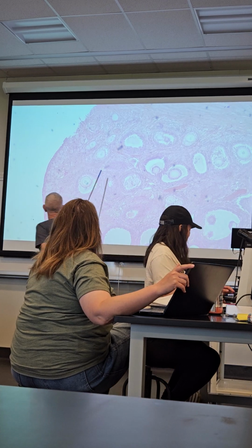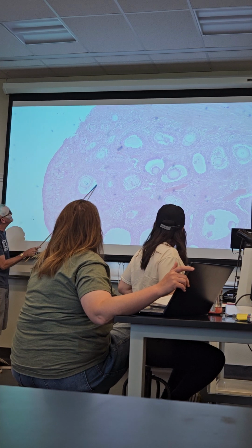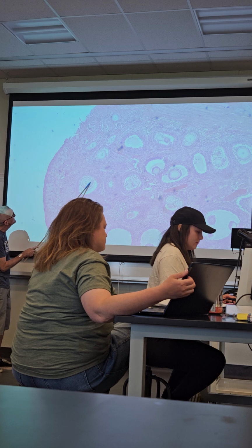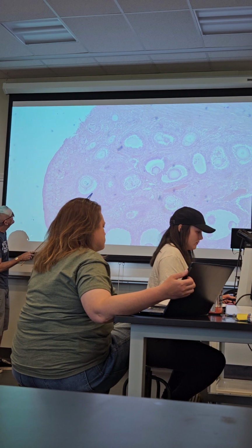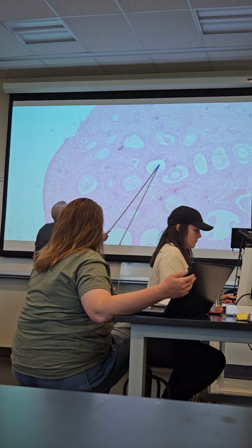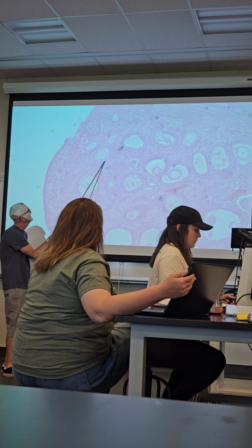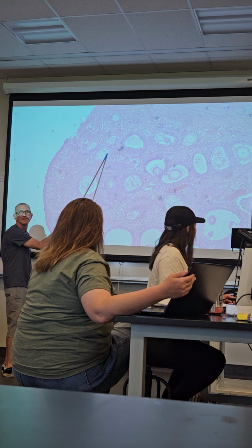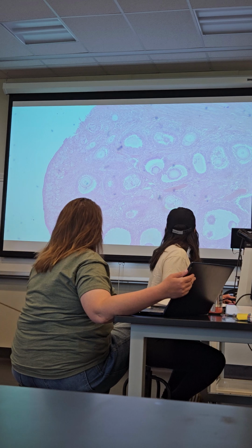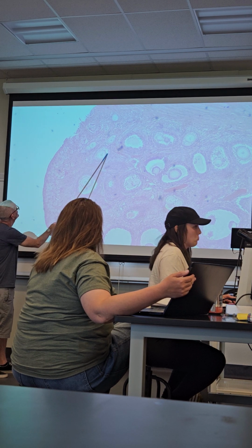What's this one? Secondary, small antrum, fairly central oocyte, nice zona pellucida, nice granulosa cells. Secondary. Ah, what's this one? Primary? Secondary? Secondary. Is that break past the first layer of cells? It is. So that's going to be a secondary, a really early secondary. It's just getting started.